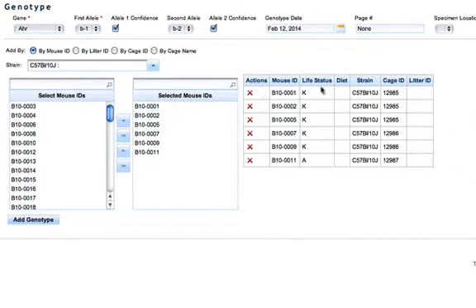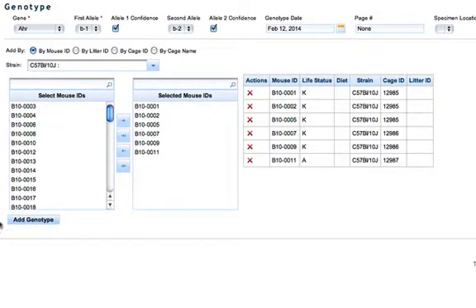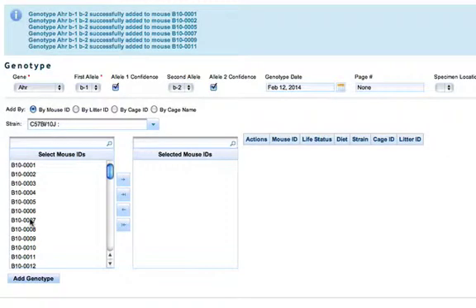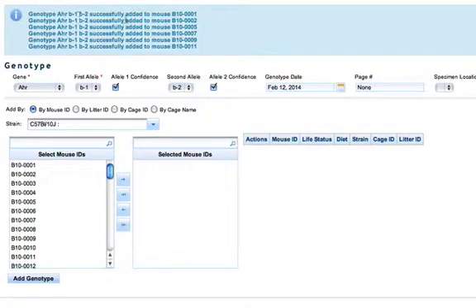You see the mice listed here, and then I'll click add genotype to add this genotype to all of these mice at once. You'll see up top that the genotype AHR has been added to all of these mice that I've selected.